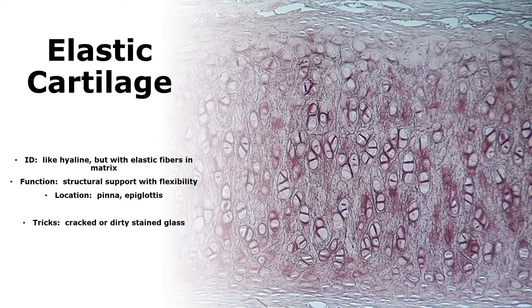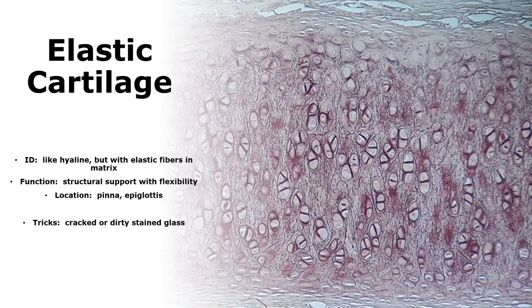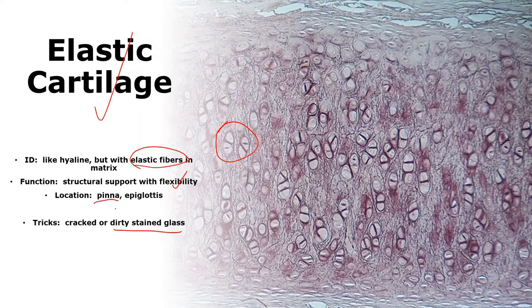This is dirty matrix. Look at the matrix — there are snakes or cracks in the glass. Those are elastic fibers, which is why we call this elastic cartilage. I can still see chondrocytes in lacunae, the eyes in the jungle, but the matrix is filled with elastic fibers. This gives structural support with some flexibility, such as in the pinna of the ear.